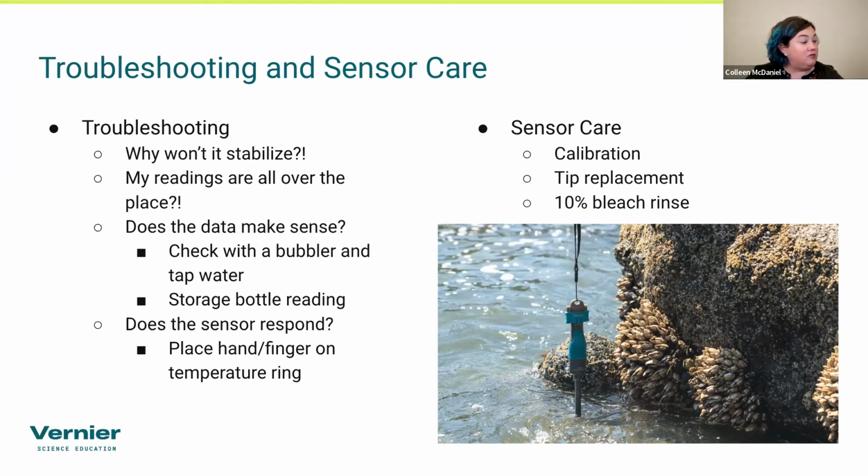And yeah, Roland, sorry, I mispronounced your name there. Roland says, when your O2 reading varies randomly, collect a minute or two of data and then take an average. Exactly. That's the other thing I highly recommend doing, especially when students have trouble, especially younger students. I find this common with middle school students, freshmen and lower levels in high school. They really want to have that perfect number, and it drives them crazy when they can't get a perfect number because the values are constantly changing. So if you take about 60 seconds of readings and then average that, that's a great way to get a good value.